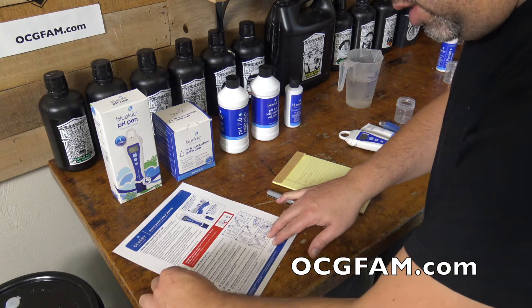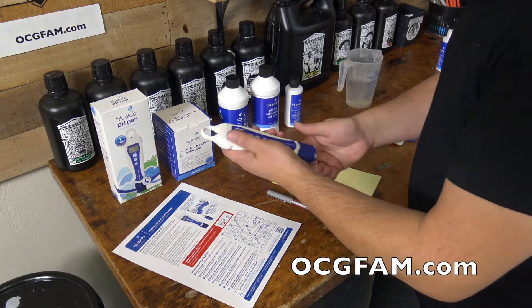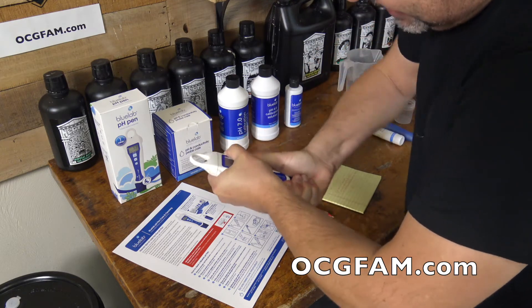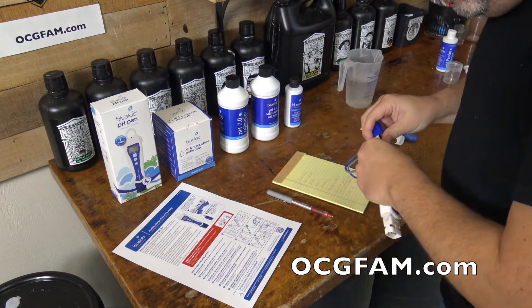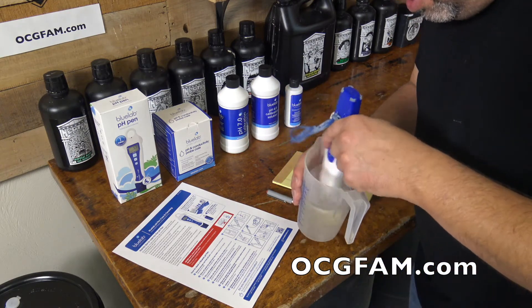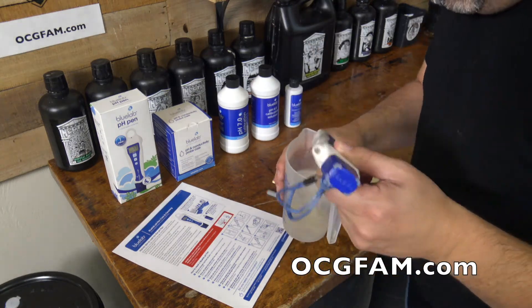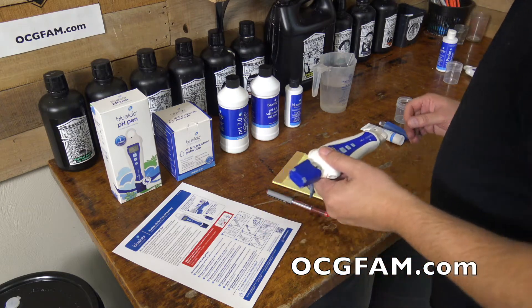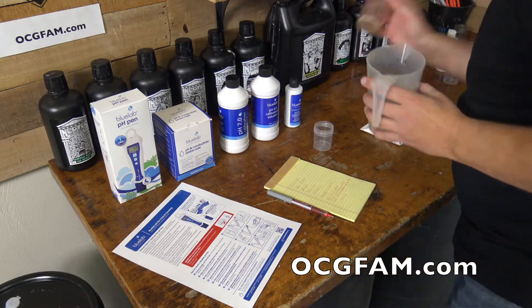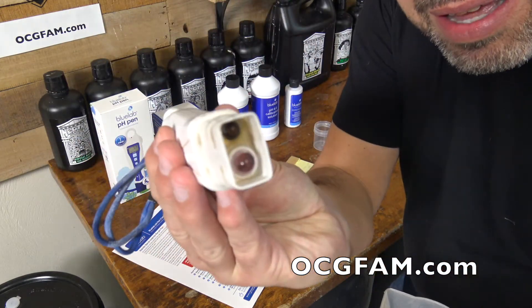All of our instructions are right here on the sheet from Blue Lab — there's a link in the comments. The first thing it says is remove the storage cap from the pH pen. What you do is rock it back and forth and it kind of pops off. When you first get this thing it doesn't want to come off, so just keep rocking it back and forth and eventually it will. Now I'm going to swish it around here to rinse it. Use a plastic cup, not a glass one — those could break the little glass thing inside the probe. You don't want to break that.